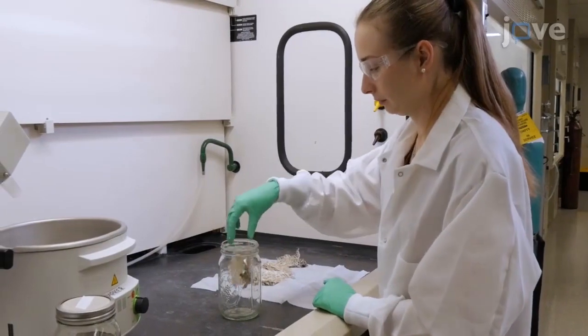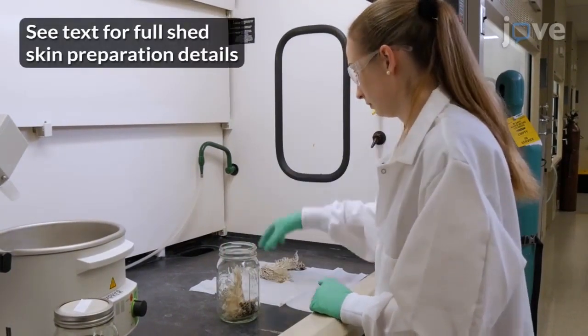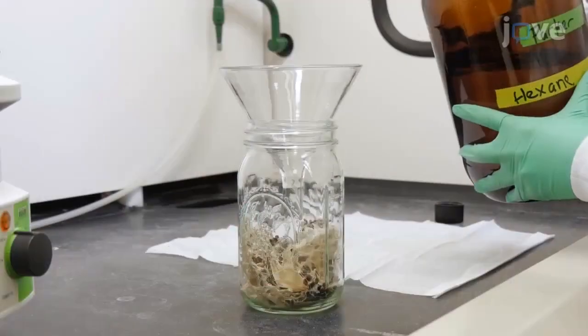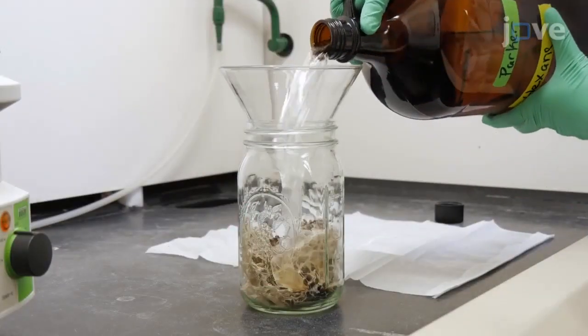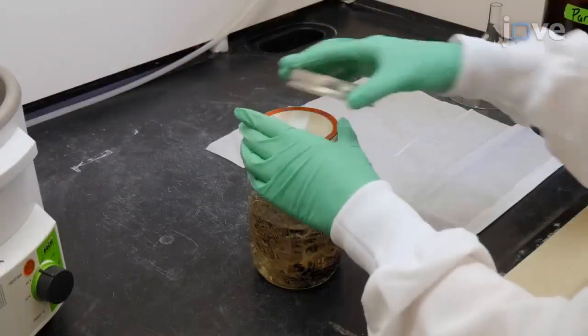Begin by placing 5 cm squared pieces into a sealable glass container with a hexane-compatible lid, and adding enough hexane to the container to fully submerge the shed skin pieces before sealing the container.